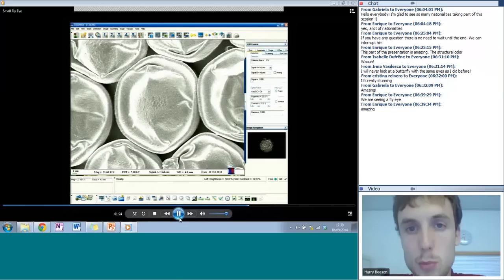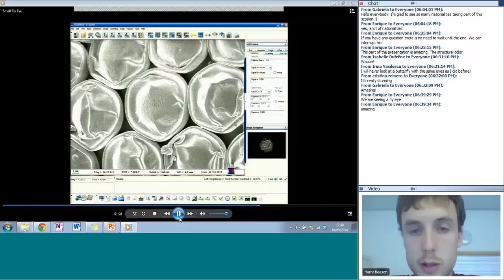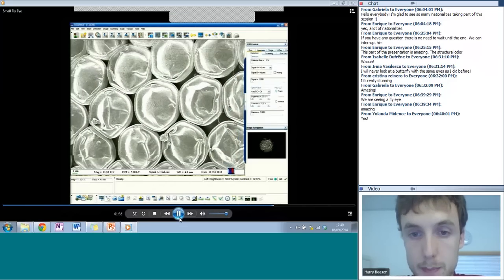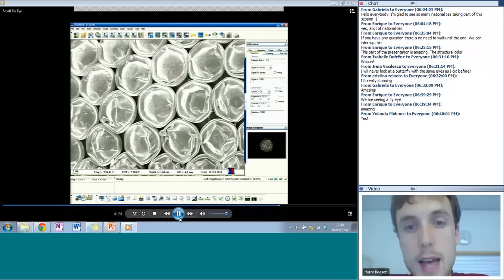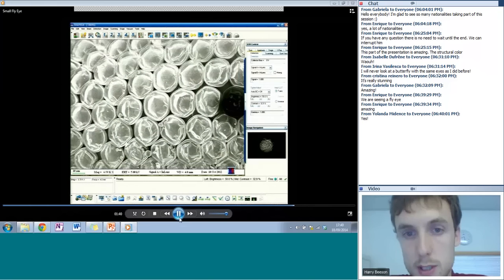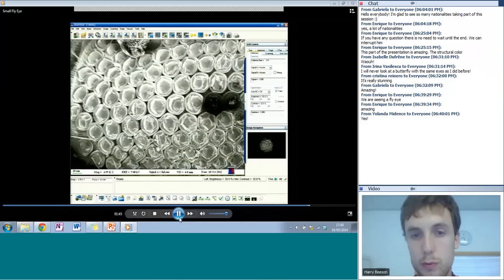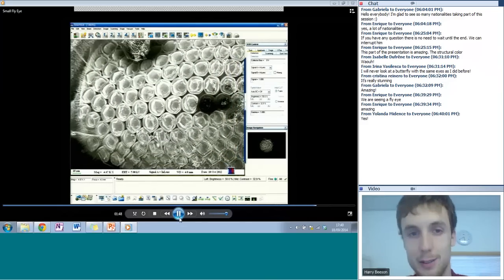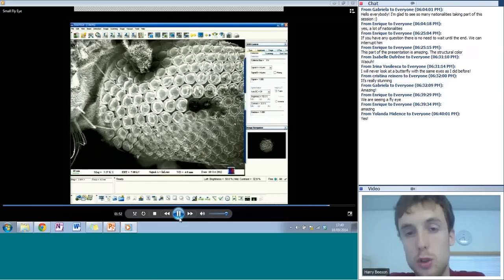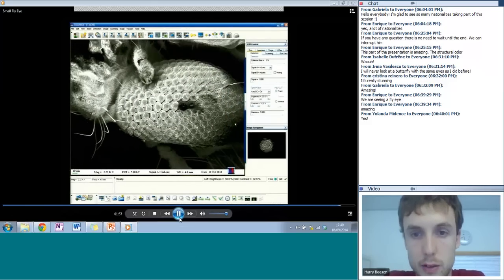As we zoom out further, you can see more and more of these circular objects. In fact, that's because the fly's eye uses a compound eye technique, rather unlike ours. So it basically detects the direction that light is coming into its eye by channeling it down one of an array of tubes, essentially. I'm not a biologist, but tubes that collect the light. And obviously, if you can tell which direction the light is coming from, then you can use that to build up the image. So that's how the fly's eye works.